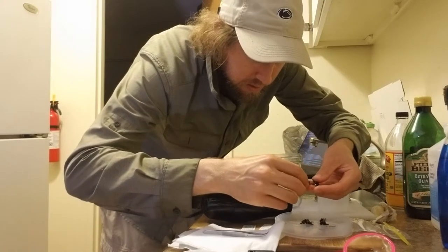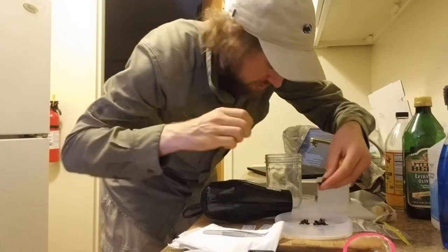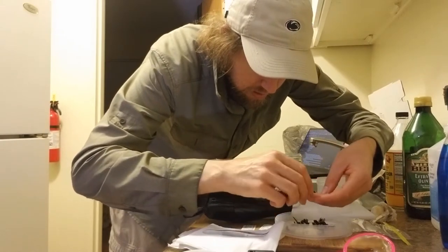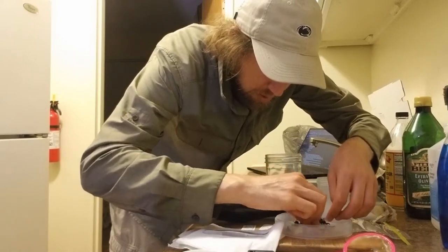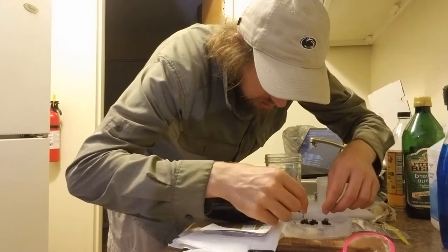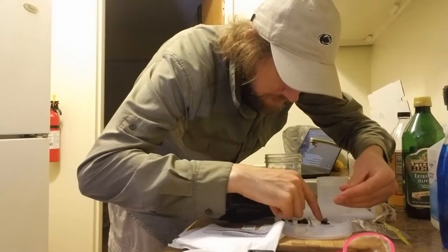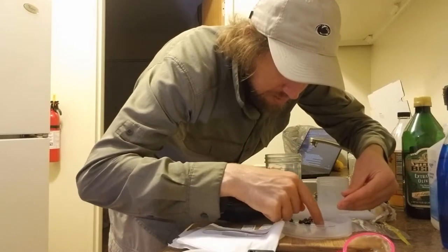I think these are all bees. I'm also just going to pick out some chunks of leaves and flowers and stuff in here. Here's something that's not a bee — I got a true bug. Everything else is a bee or a wasp so we're doing pretty good. Got a true bug and some other little mystery bug here.